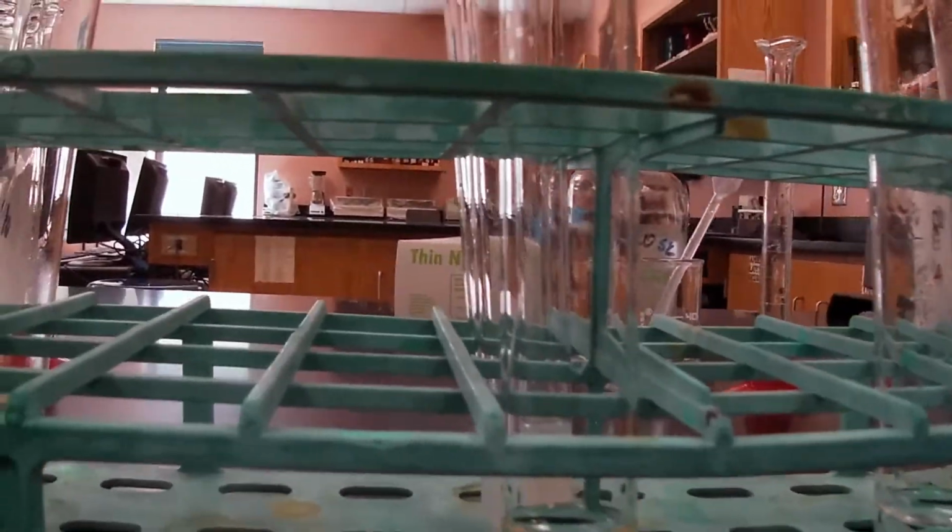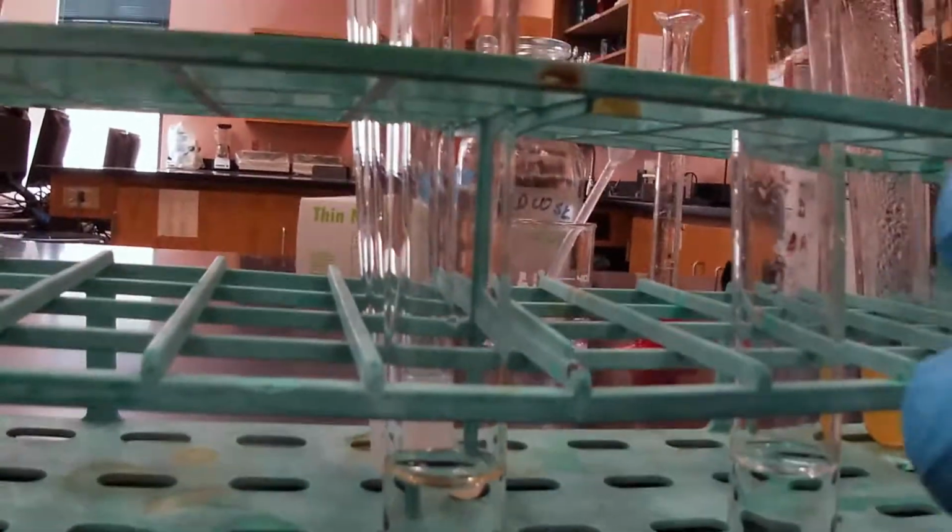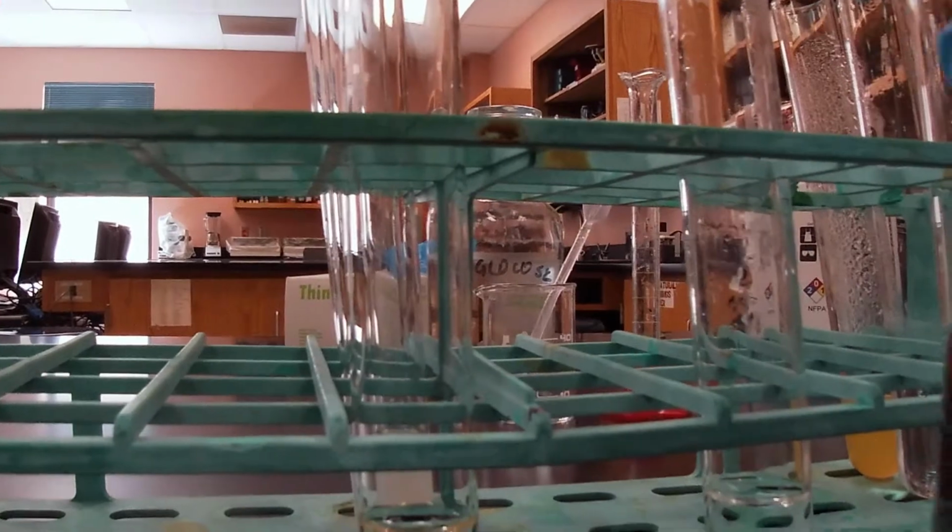Next, we're gonna go ahead and add our silver nitrate into our middle contents. So again, these are after 30 minutes. We're gonna add a few droplets.